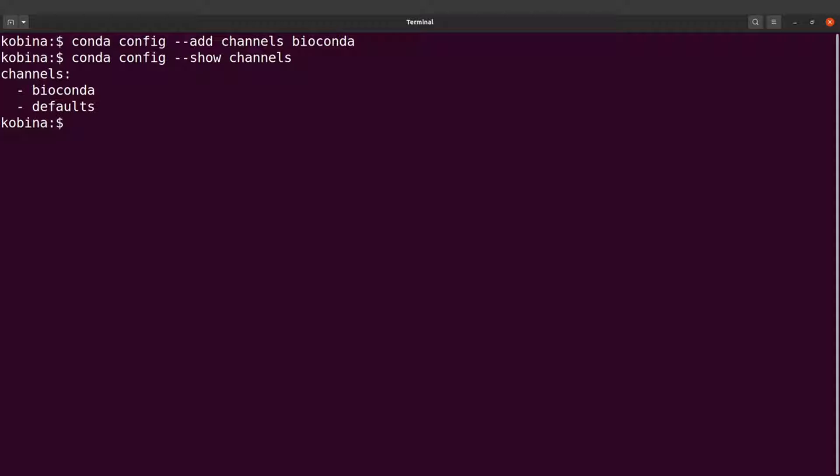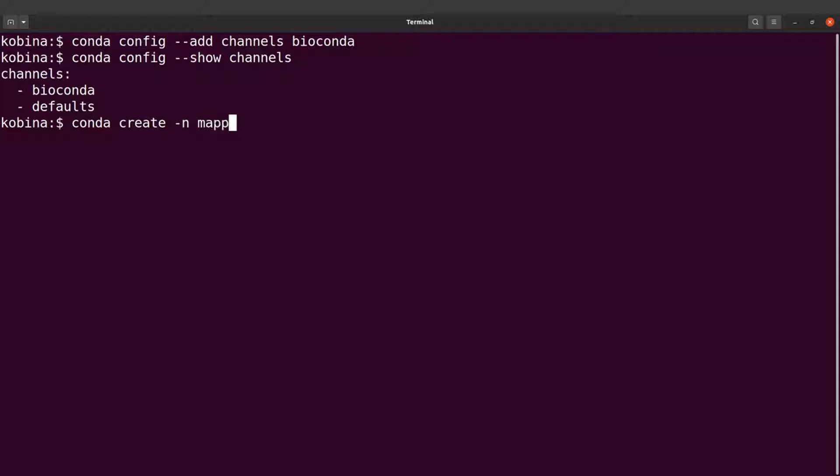Now we are going to install STAR. So what you are going to do is to first create an environment and install STAR in that environment. So we will say conda create dash n and we specify the environment's name which is mapping. And then we indicate the tool we want to install. In this case STAR. So now we can run this command.